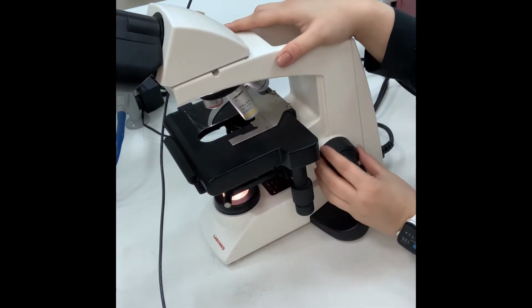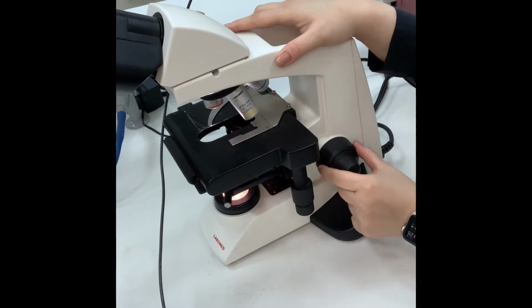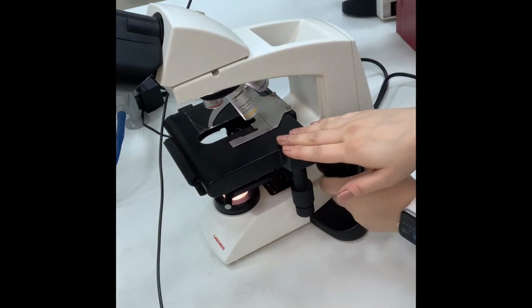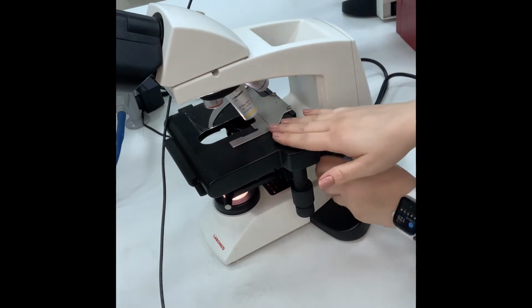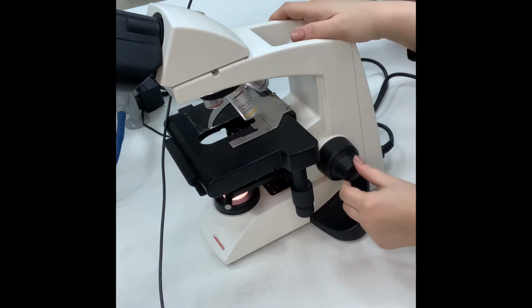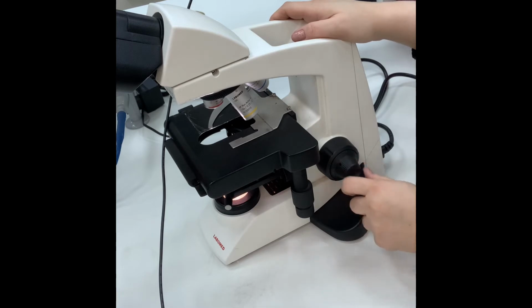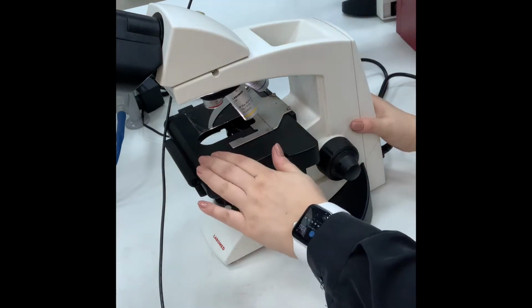I have here 2 knobs, the big one and the small one. This is the big knob. Look at the big knob, it controls the stage also. It takes it upwards and downwards. And this is the sharp or fine focusing, so coarse and fine focusing knobs. This is the arm of the microscope that carries the stage.